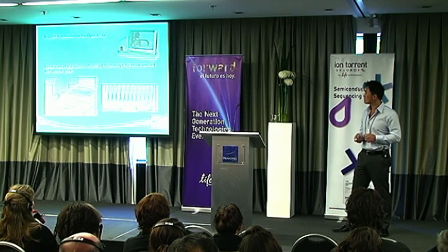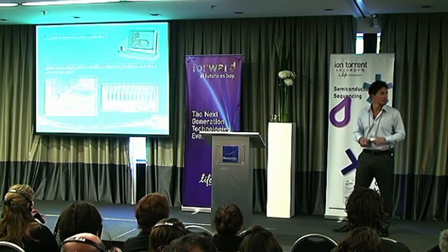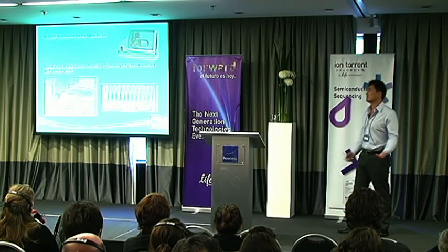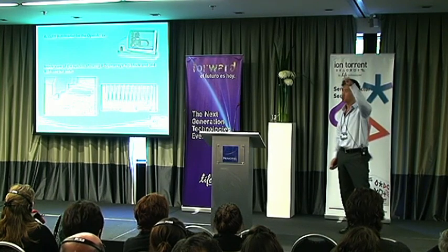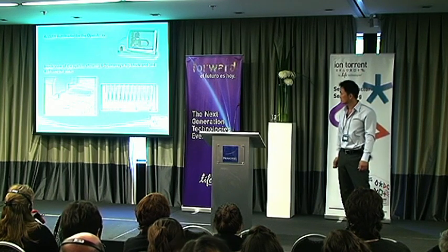So what we have is an automated loading device. This is called the AccuFill system. That's what I have depicted here at the top. The AccuFill device is a liquid handling deck. It's very simple. It comes along with the instrument. You just lift up the door. And then there's a picture here of what's inside the loading system.